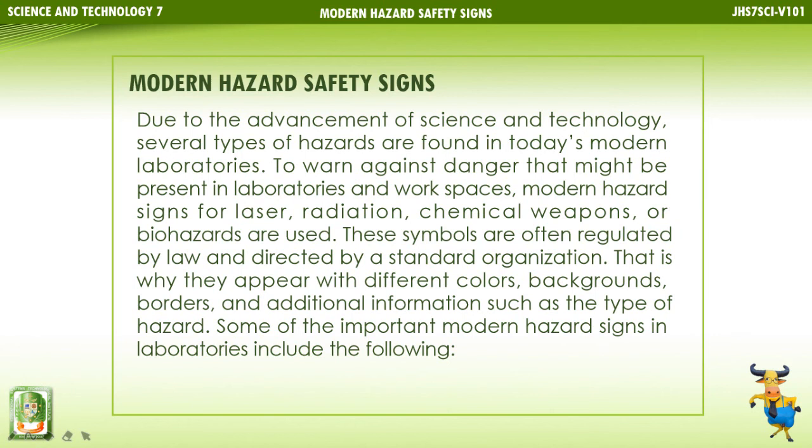These symbols are often regulated by law, and directed by a standard organization. That is why they appear with different colors, backgrounds, borders, and additional information such as the type of hazard. Some of the important modern hazard signs in laboratories include the following.